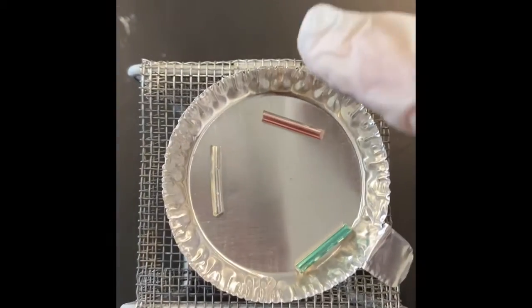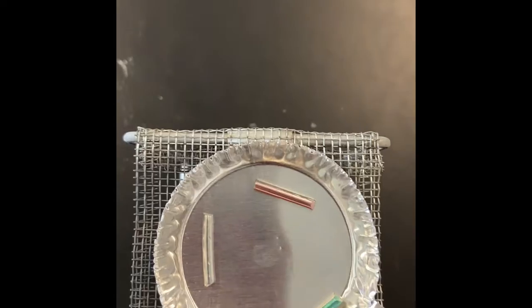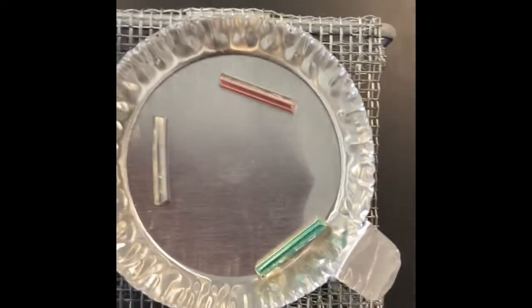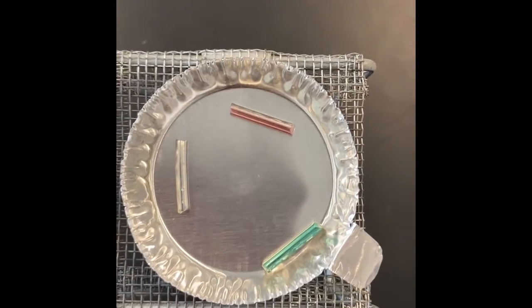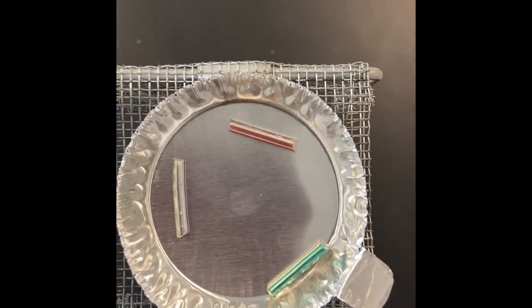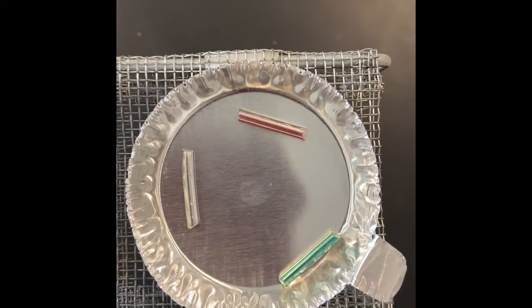Now, I have 3 totally different pieces of solder here. They've been color coded. This one's colored red and green. I think the back side of this one is blue. And they're color coded to remind me that they're different, because each of these are actually slightly different mixtures of metals that give these different pieces of solder different properties. We're going to look at one of those properties now, the melting point.